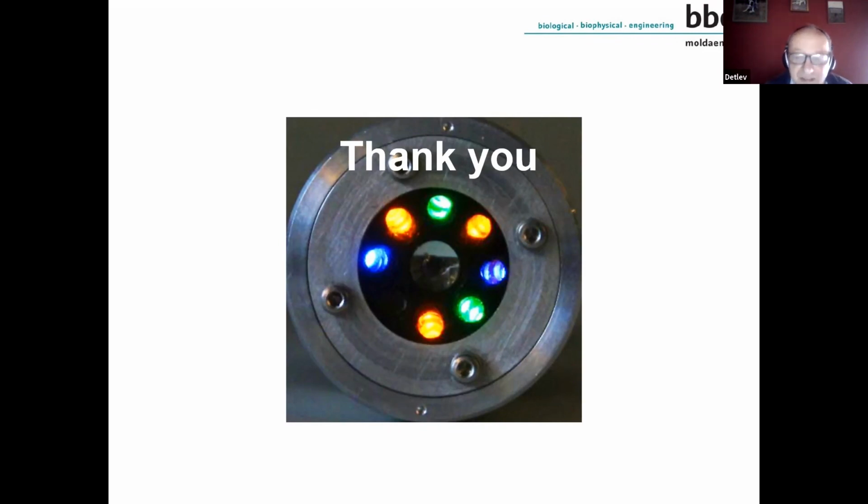But in general, I would say this is a measurement more for the surface. We have another instrument. You can get the information from Tim about this, the fluoroprobe, which is really a submersible instrument, which is designed for real profiling. But here you can see it when you need only sometimes a profile, you can do this with the AlgaeTorch.